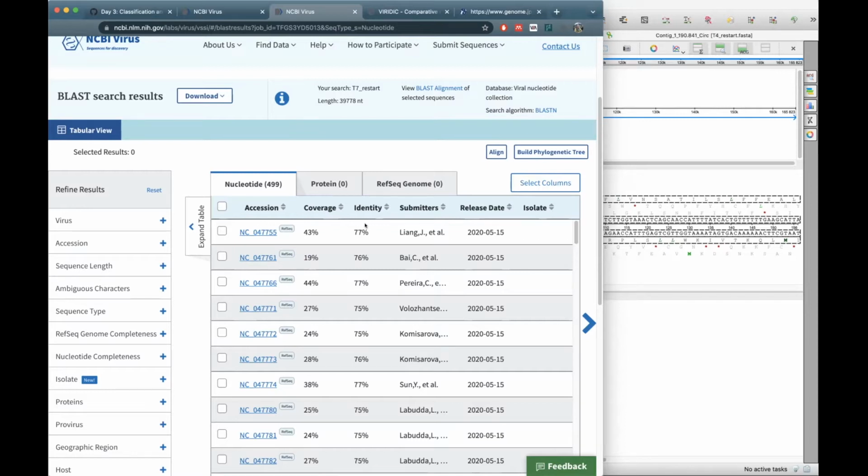Anna, do you have a question now? Yeah, sorry, I was muted. I wanted to know, if you don't have the restart knowledge, if you're working with something where you don't know exactly where it will restart, is this going to affect your result a lot or not? For BLAST-based searches, it's not really going to make a difference because it automatically takes that into account.